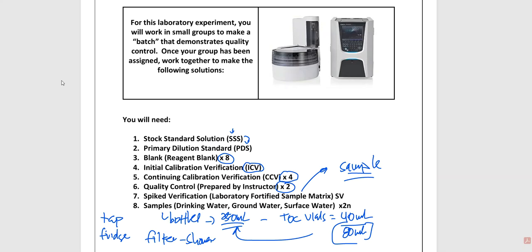You can go out of your home and go to the outside water spigot, crank that sucker open, catch some water, and bring that in. If you've got a nearby river, lake, or stream that you want to bring some water samples in, that is not a problem either. So go catch it. Just be really careful that you don't fall in. If you do fall in, I wish I was there so I could see it happen.